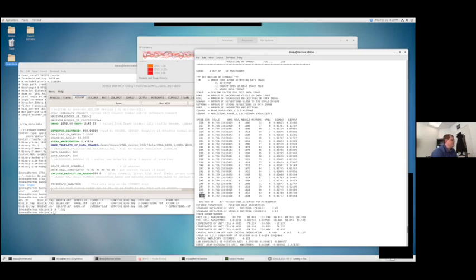And you can easily lock up the computer because all the RAM is going to the XDS processes and you can't even move your mouse around, because drawing that mouse takes some RAM and it can't access it.